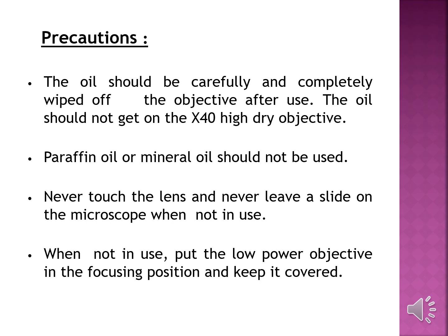Never touch the lens and never leave the slide on the microscope when not in use. When not in use, put the low power objective in the focusing position.